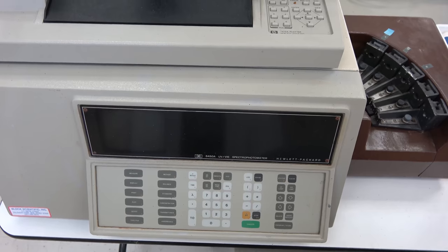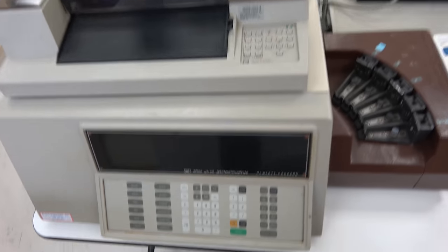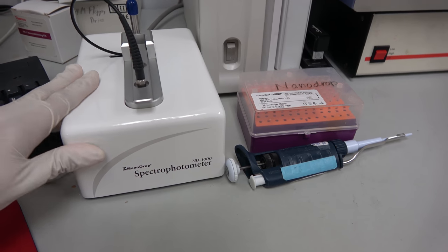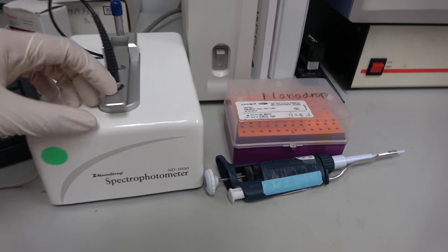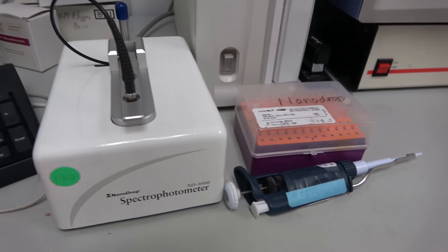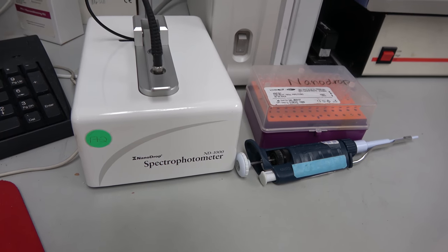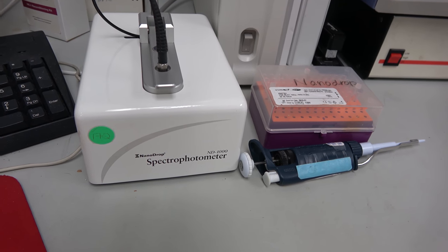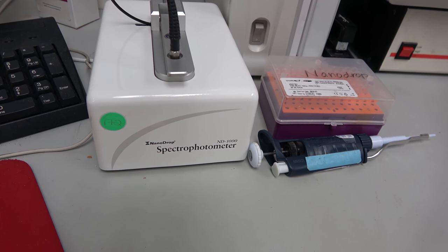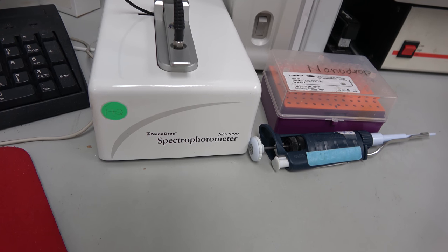This spectrophotometer is really fucking old. It's from the 80s but it's still useful as long as the spectrophotometer is working it works and it has a lot of significant digits and it's accurate. This is another kind of spectrophotometer called a nano drop. This is much different than the bigger one that I showed you back there because this one you can analyze tiny tiny amounts of liquid in here. And you hook it up to the computer and you use the computer to analyze it. And I also fucking hate this machine. I don't want to get into it. It's traumatic. It's so, so traumatic. I hate this machine so much. Makes me want to rethink my life choices. This son of a bitch has put me through so much pain. So much sorrow. Anyway.